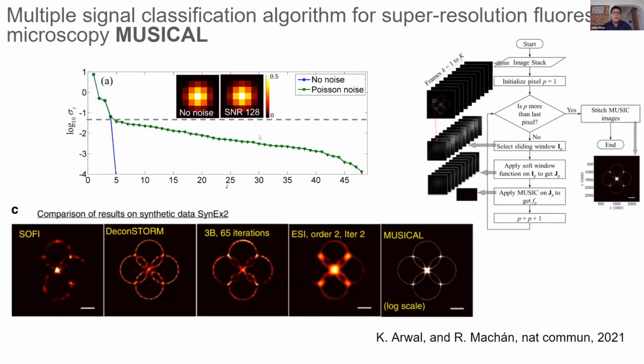Okay, with that, I will jump now to MUSICAL. For the sake of the presentation and also for the sake of clarity, I won't saturate with examples of everything. I will cover to some extent the theory of the methods, but I will do the demonstration only for MUSICAL and measure. And these are the tools that we are about to explore. MUSICAL is one of the ones that will be presented today as a demonstration.